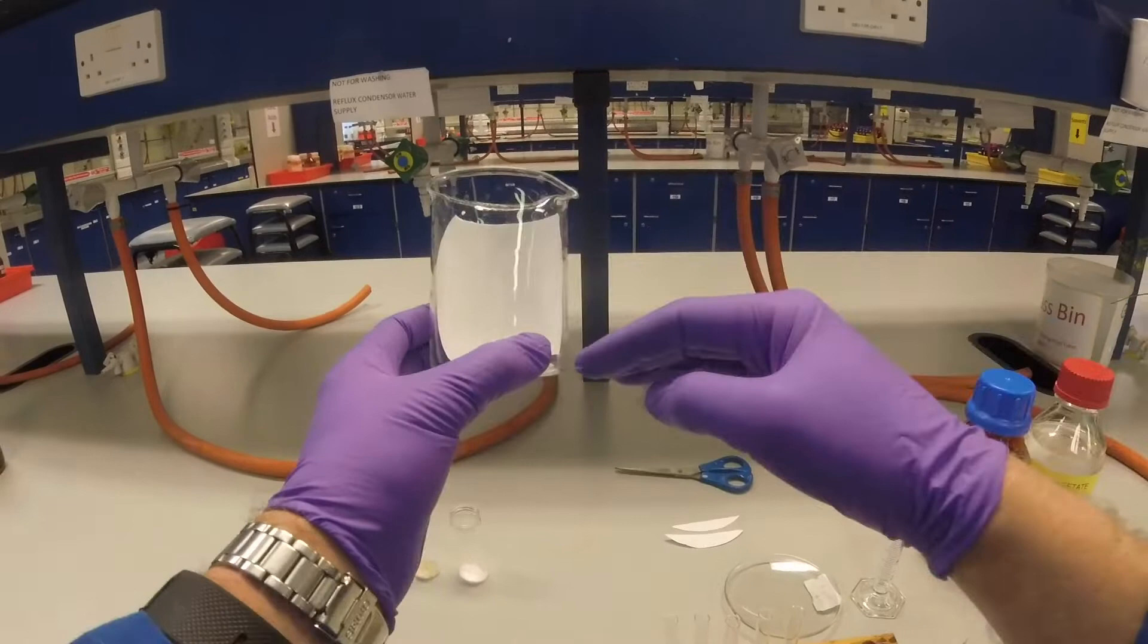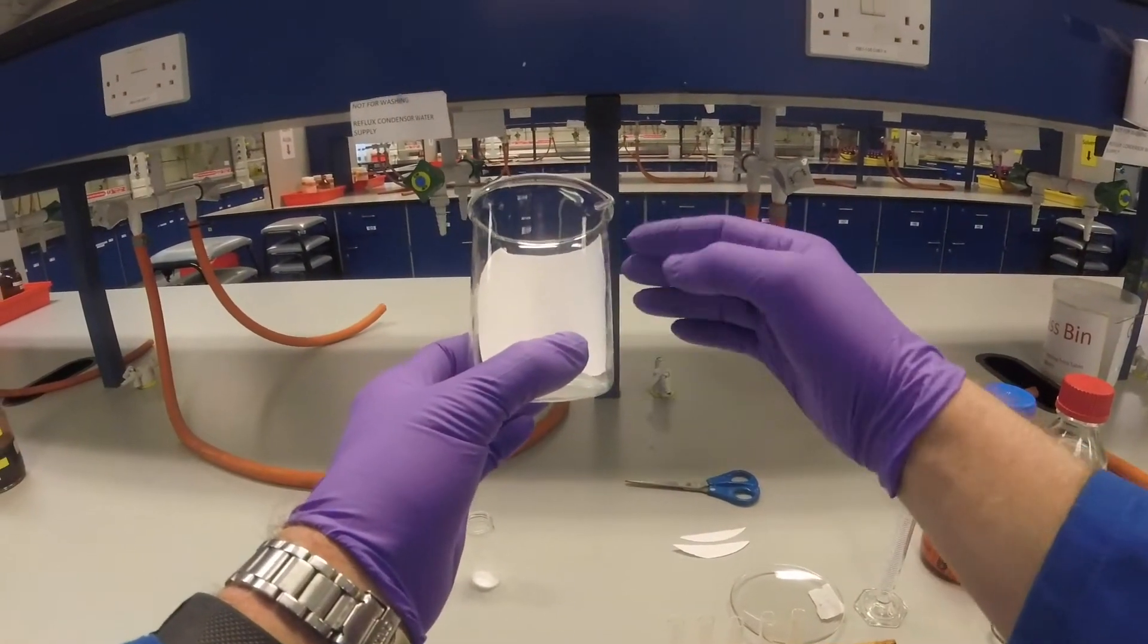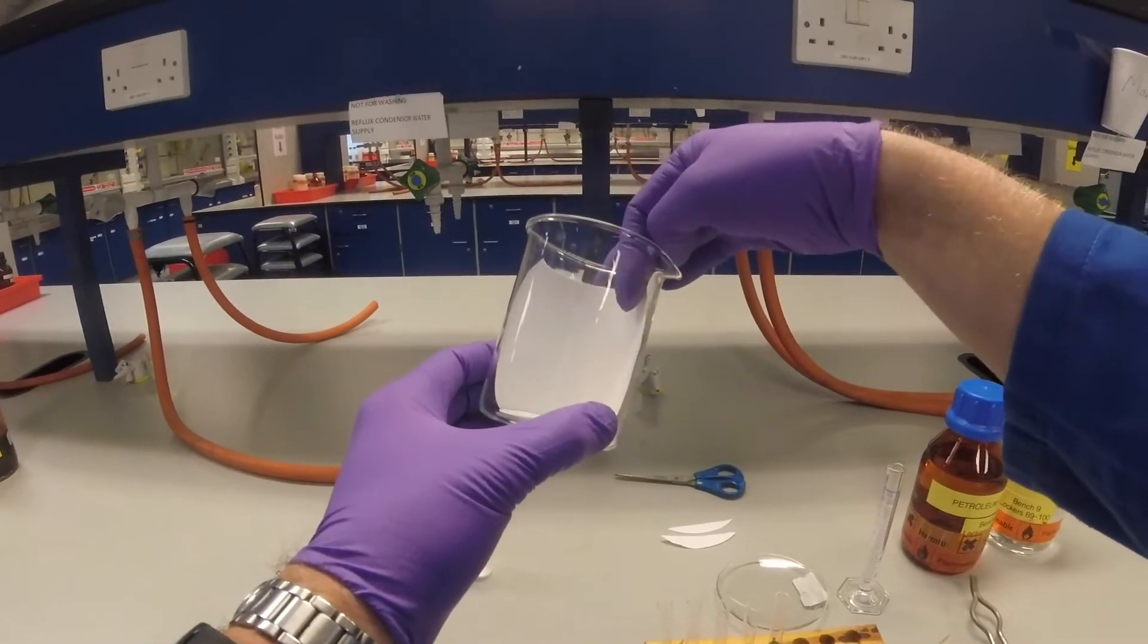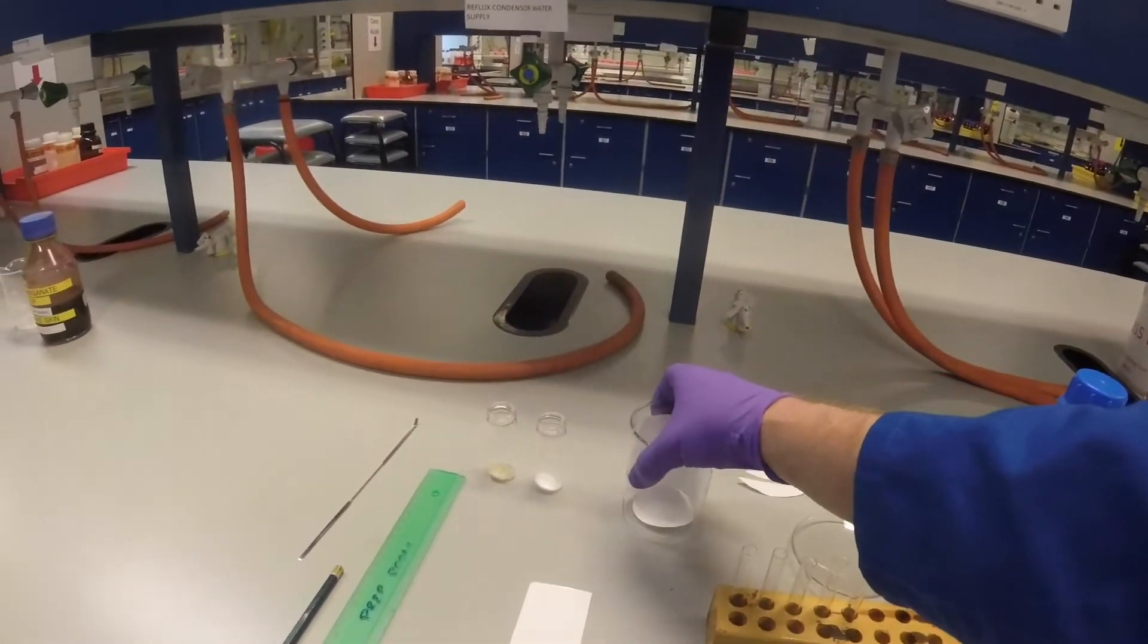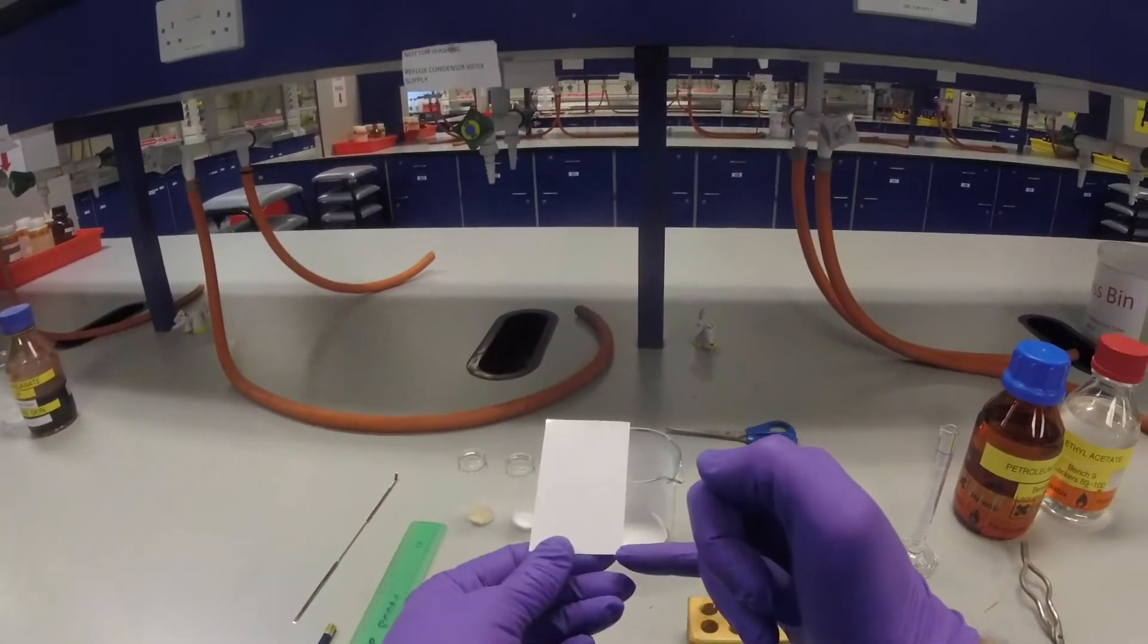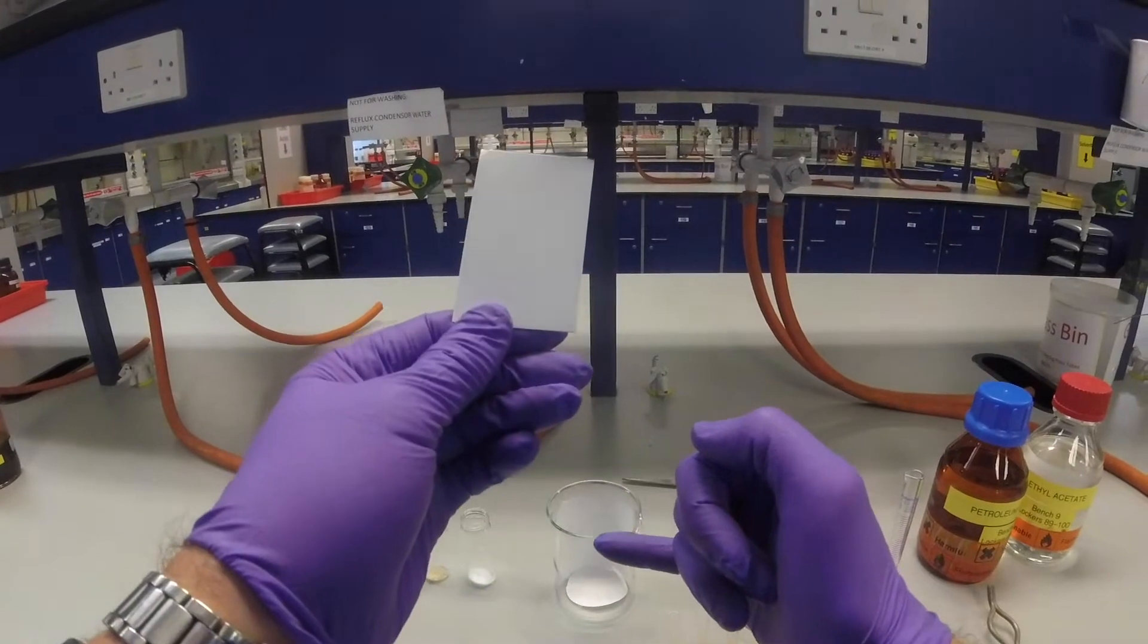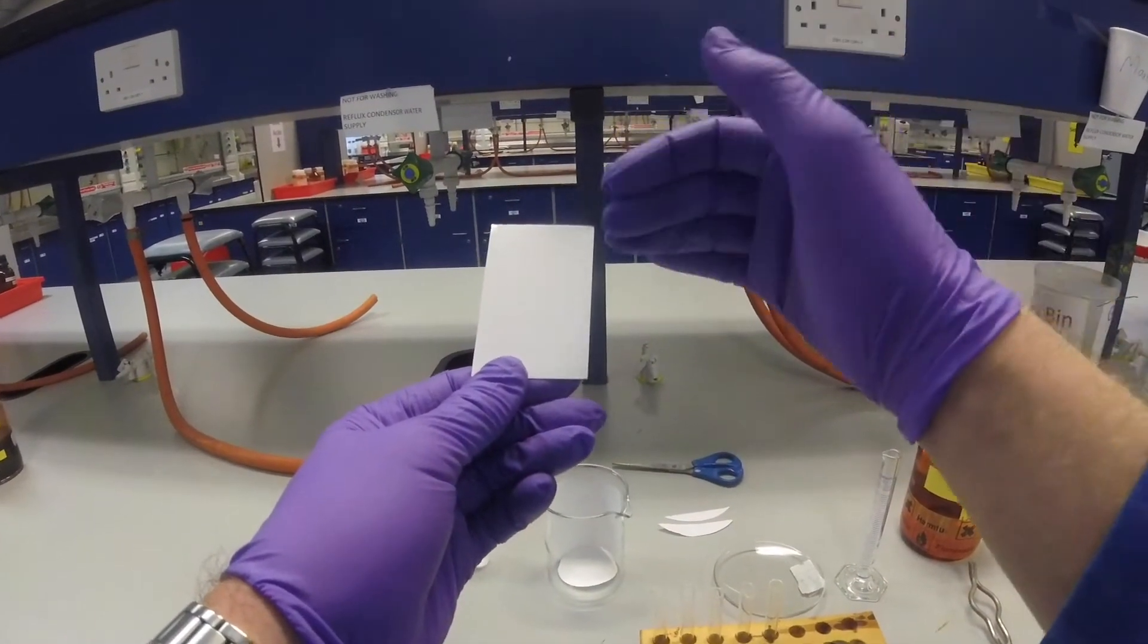When you put your solvent in the TLC tank and it runs up the plate, it'll also run up and soak this piece of filter paper, which means the atmosphere in the TLC tank will become saturated with solvent so that when your solvent is going up your TLC plate, it won't evaporate into the atmosphere around, it will stay there.